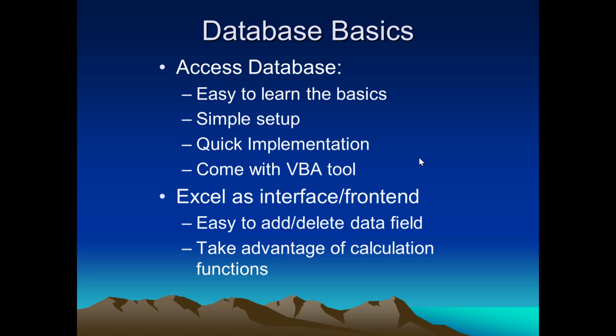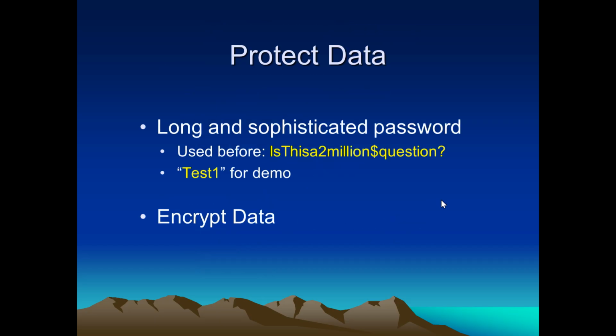There are two reasons. One is that it's very easy to add a field for data collection, which is just one cell of an Excel worksheet. In addition, because Excel has built-in functions for calculations, when we do cell calculations, that's a very useful function I can use directly without programming. That's the reason I use Excel. Both software support VBA, so they are integrated with VBA. Once you learn one, you may know the other already. There are some minor differences.